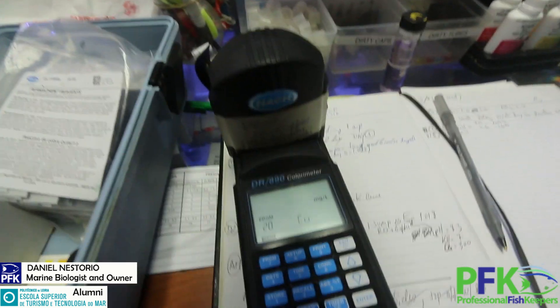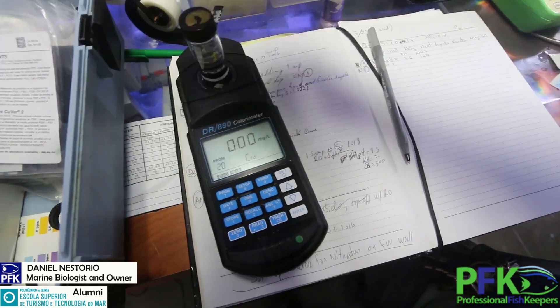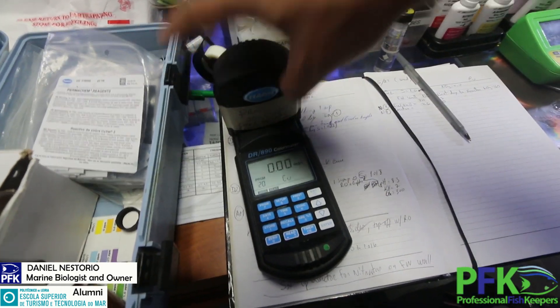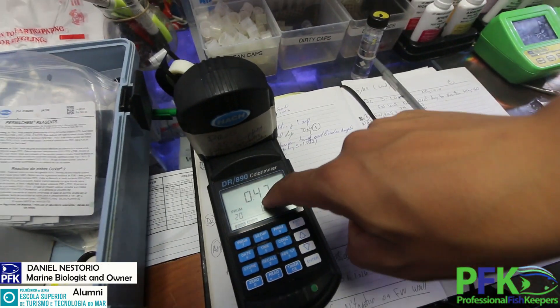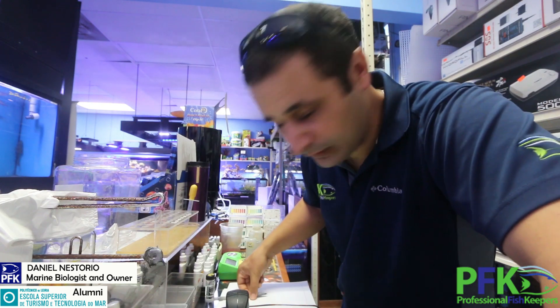Put the blank tube in, press zero — that zeros it out. Now put in the sample tube that has color, then press read. The result is 0.47. My goal is 0.5, but 0.47 is already working very well. I'm still going to dose a little bit more.